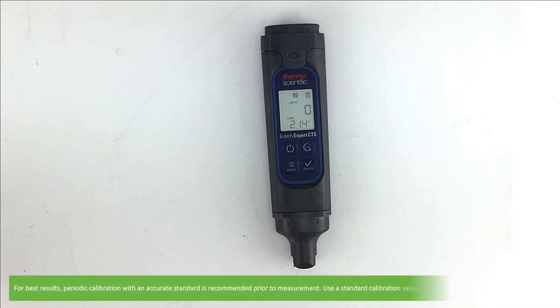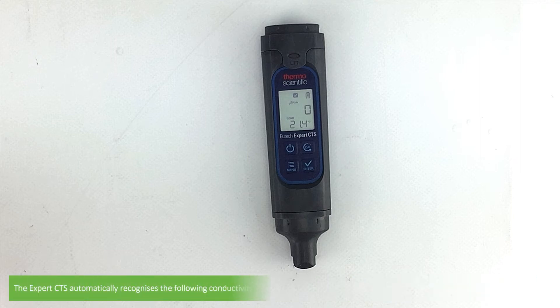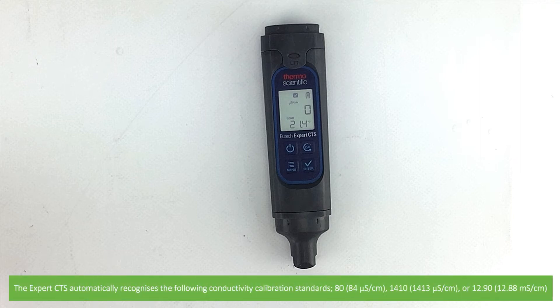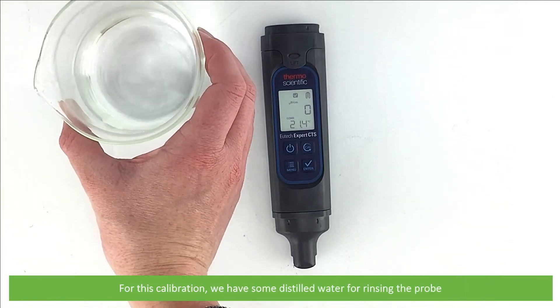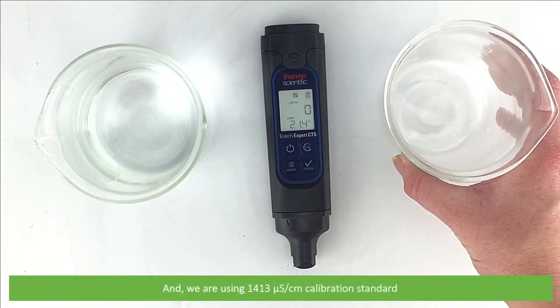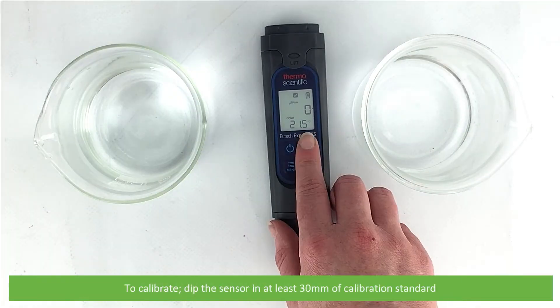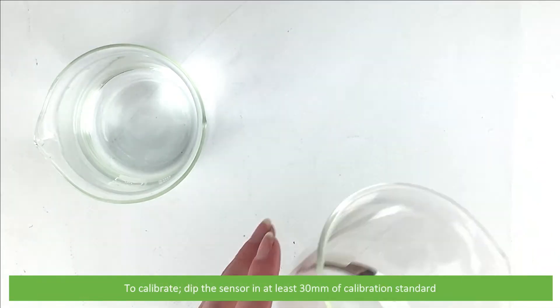For best results, periodic calibration with an accurate standard is recommended before measurement. Use a calibration standard value that is close to your intended sample value. The Expert CTS automatically recognizes the following conductivity calibration standards: 84 microsiemens per centimeter, 1413 microsiemens per centimeter, and 12.88 millisiemens per centimeter. For this calibration we have some distilled water for rinsing the probe, and we are using the 1413 microsiemens per centimeter calibration standard.